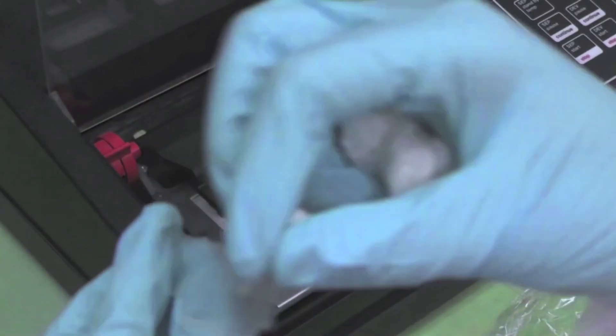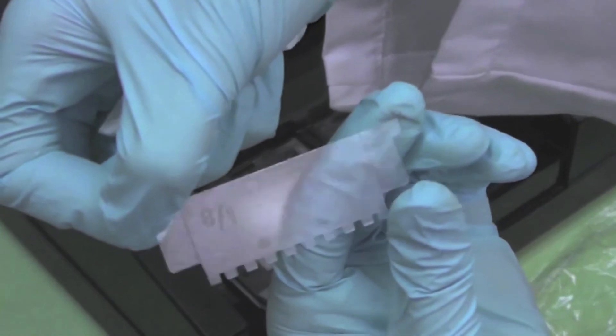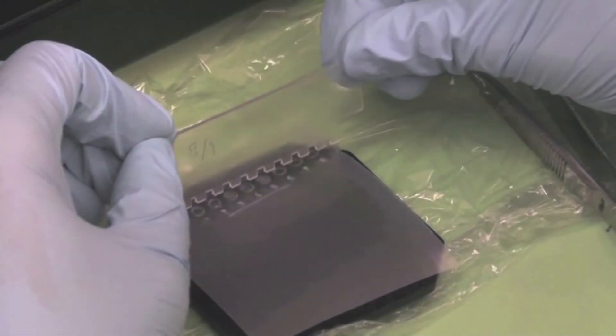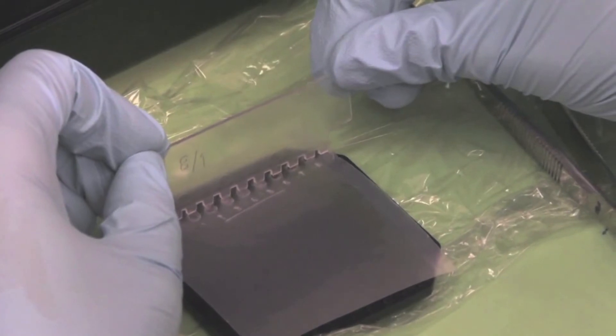Once all the samples have been placed, remove the 8-slash-1 sample applicator from the ziplock bag. 8-slash-1 refers to 8 lanes each with 1 microliter. Align the 8 teeth of the applicator with the 8 wells on the parafilm and gently touch the sample to obtain 1 microliter.